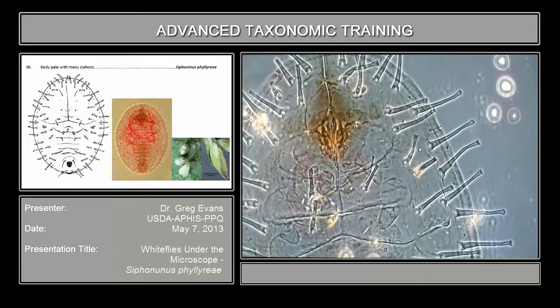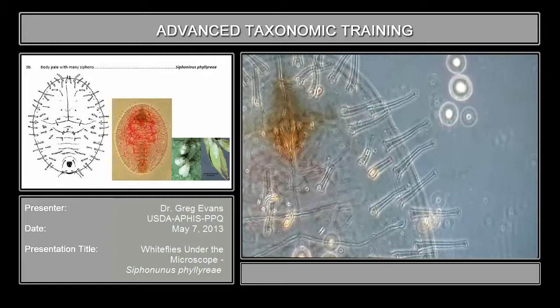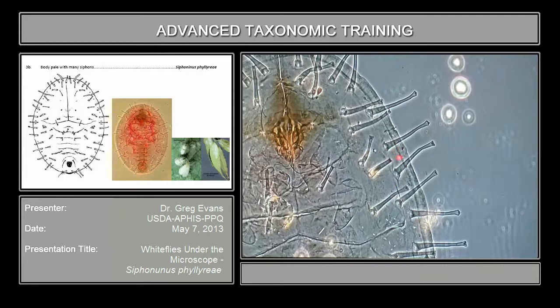Here are the mouthparts, and at the lateral margin you can see it's not differentiated. A lot of times at the lateral margin they'll either have a pore cleft or the teeth will be different at the lateral margin, but this is what we call undifferentiated because it's the same at the lateral margin as it is at the tracheal opening.